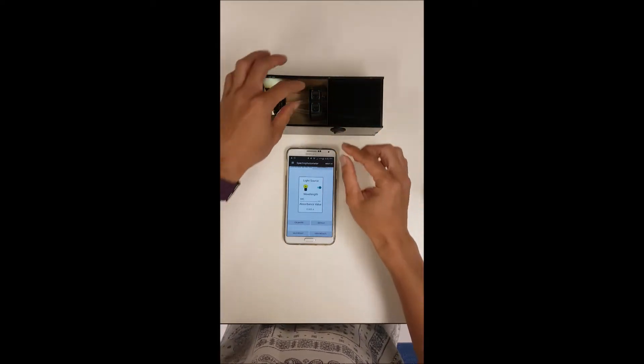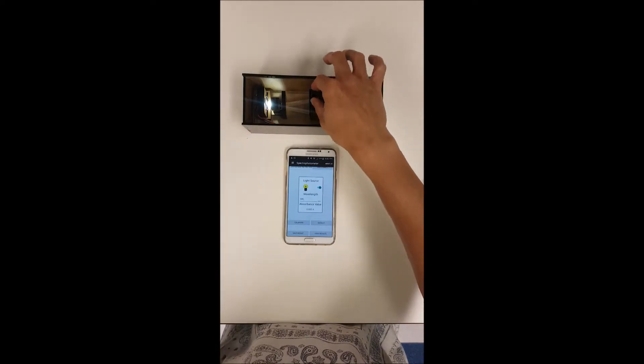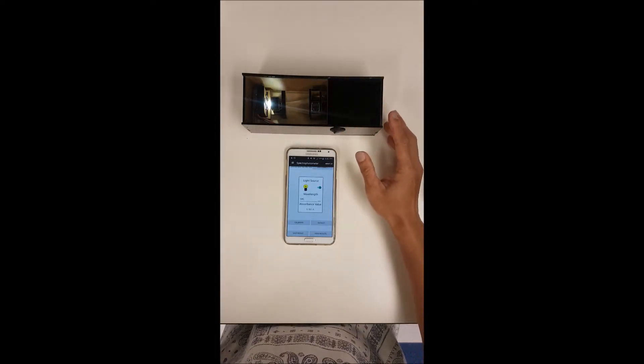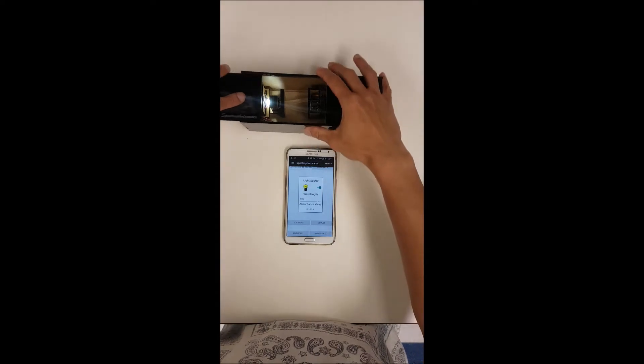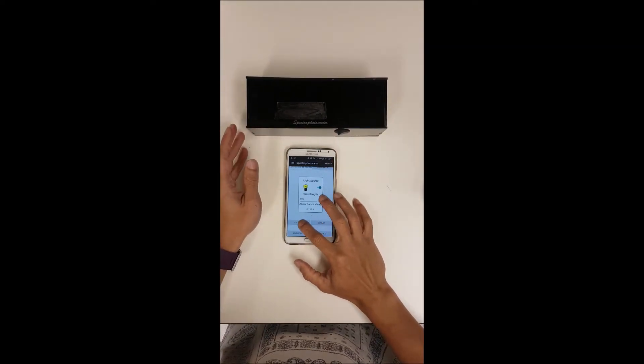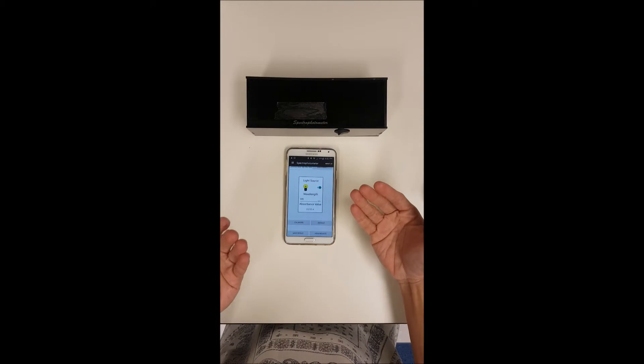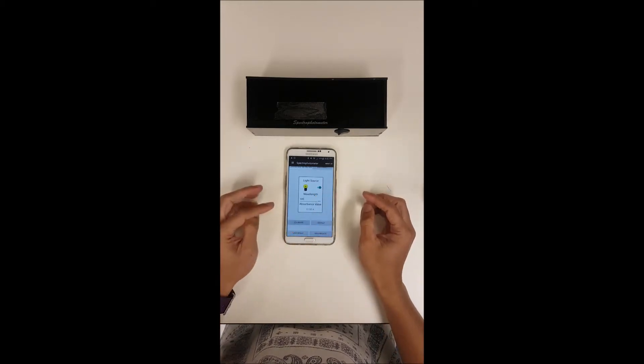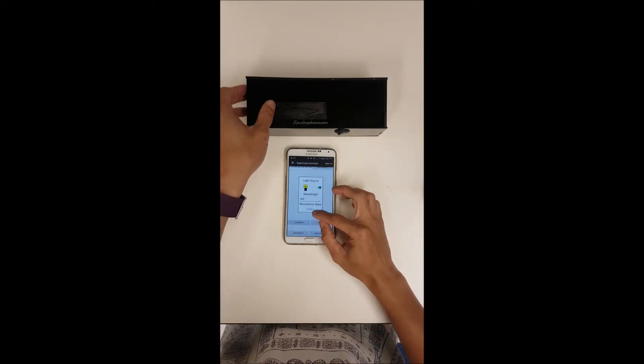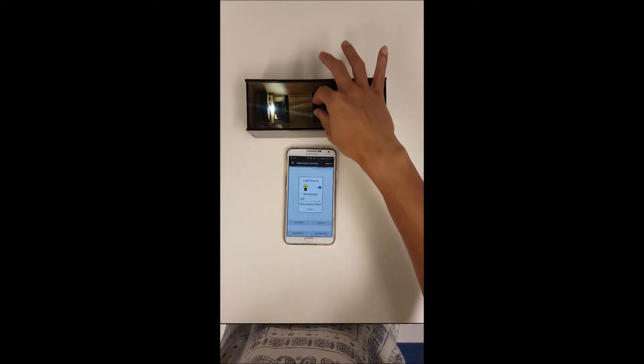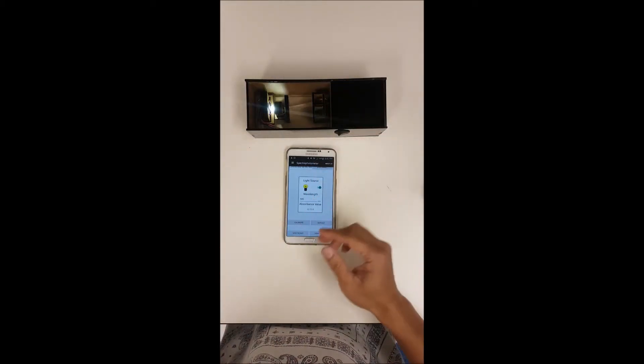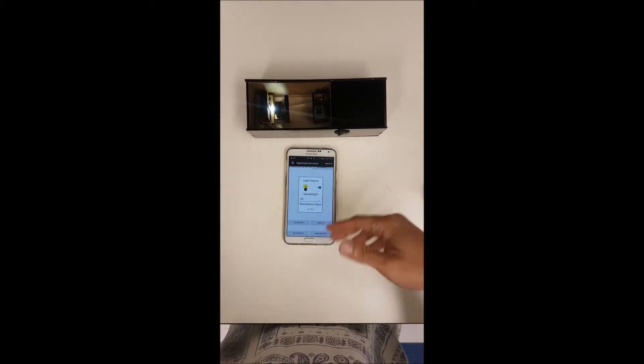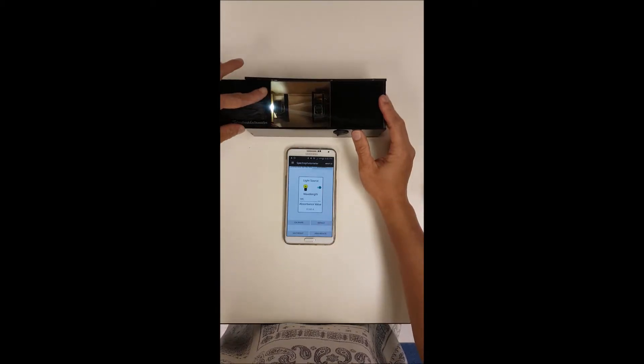Or if you so wish to, you can put your blank in the second column. Calibrate it so zeroed or at least as close to zero as possible.